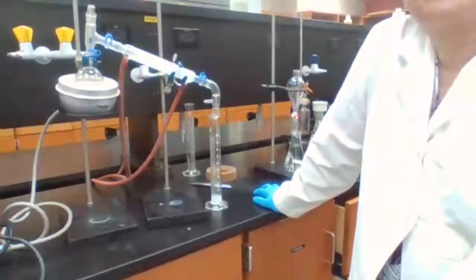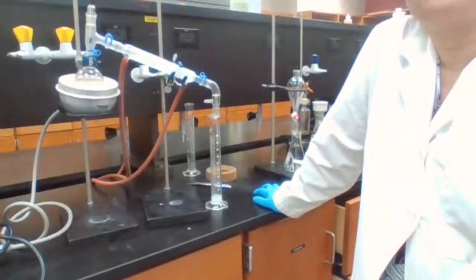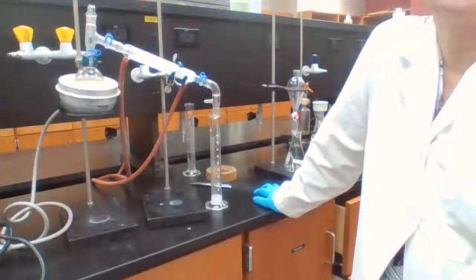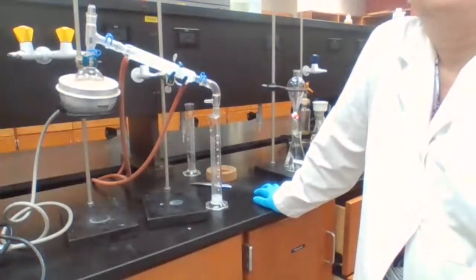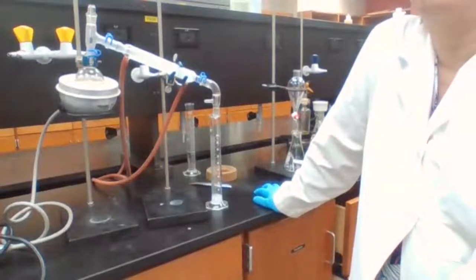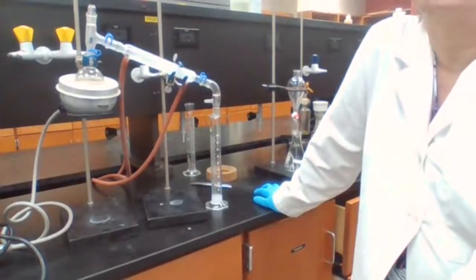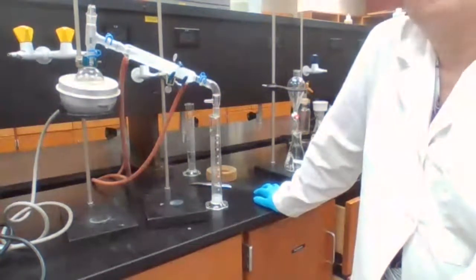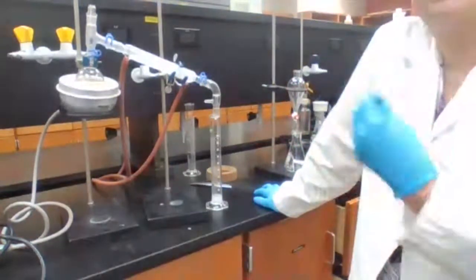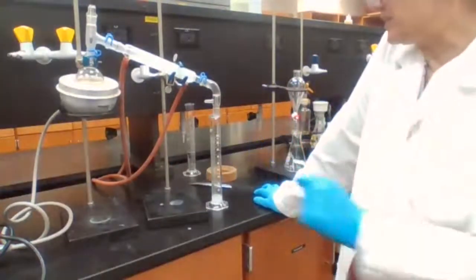Same question as the last experiment, right? When you were removing eugenol. But that was a pre-lab question as well. So you knew the answer. Couldn't it be the same thing here? Yes? When you are mixing two immiscible substances, basically it's the oil droplets in the water. Yes. It's because the amine is oily, and when it's mixed with the water, you have droplets of the oil suspended there.